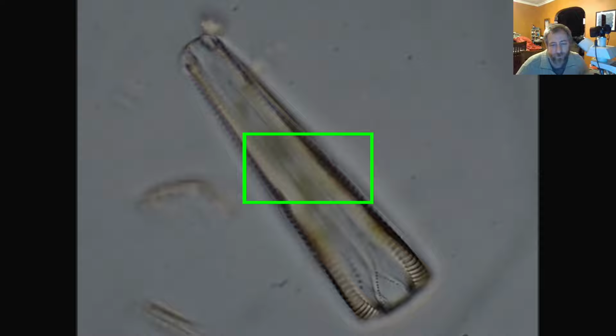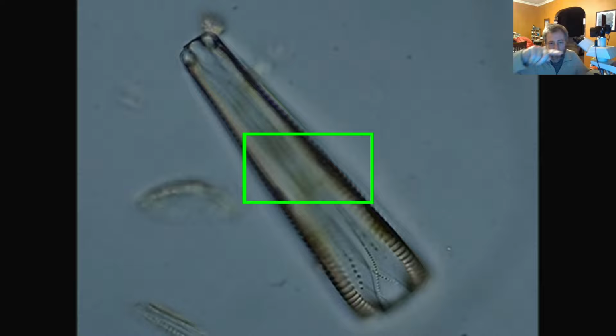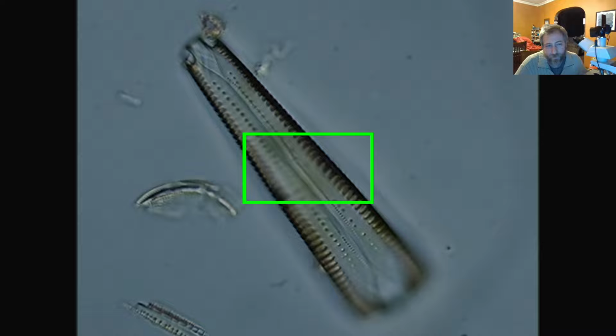So I think what Sarah is talking about is at the bottom down there, there's sort of like a twist. It's actually not a twist. It's a bit of the girdle band from the top valve and a bit of the girdle band from the bottom valve, and they overlap with each other. They're just dovetailed together, and also at the top, at the bottom of the foot pole as well. They sort of fit over top. One fits inside the other.